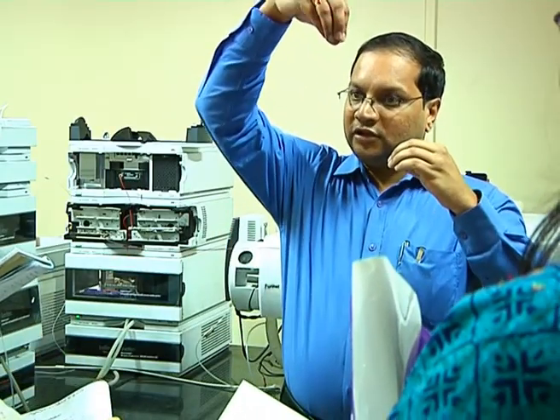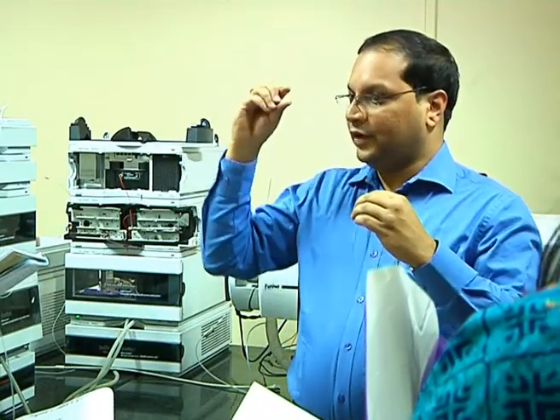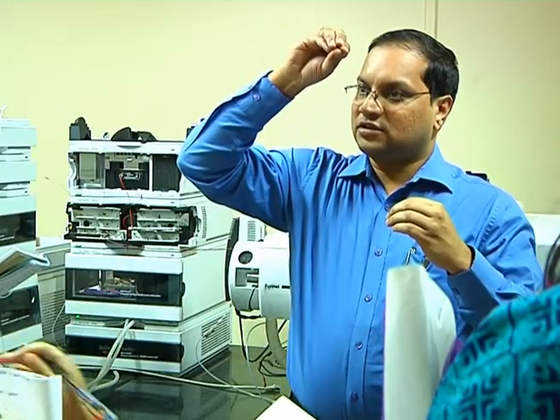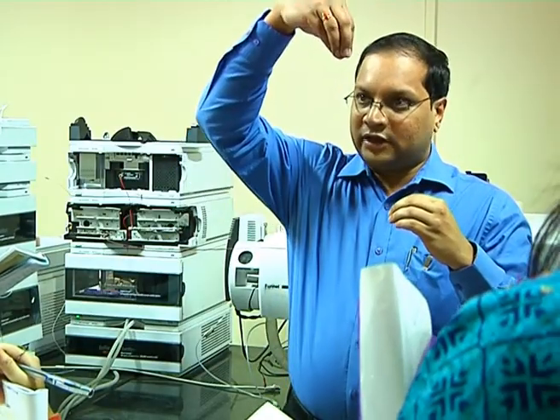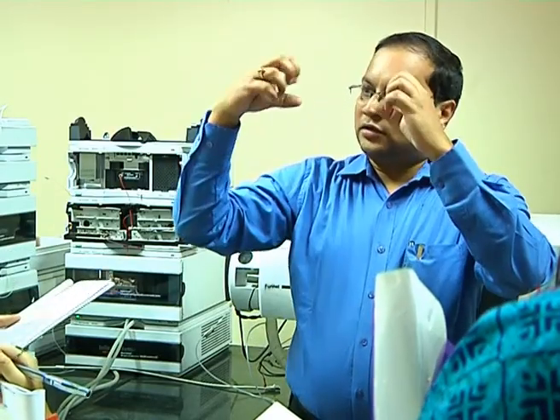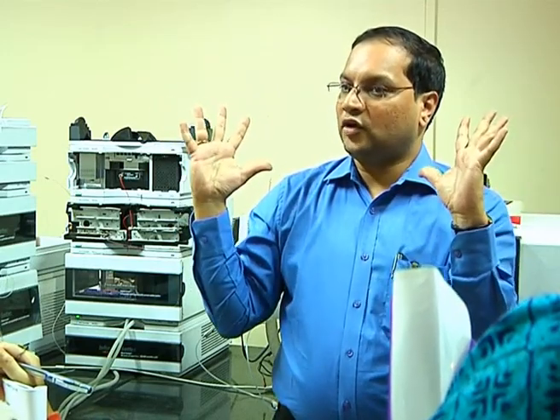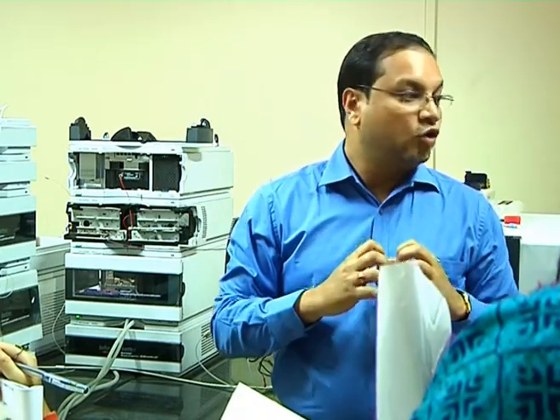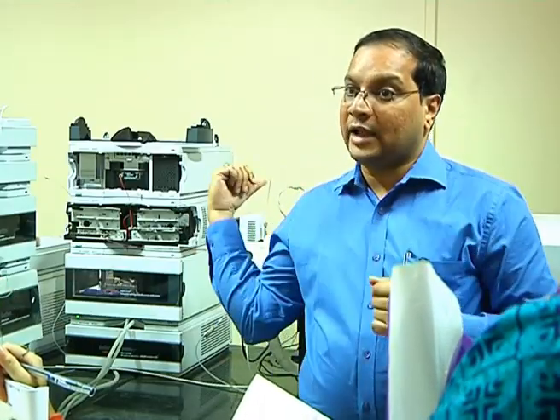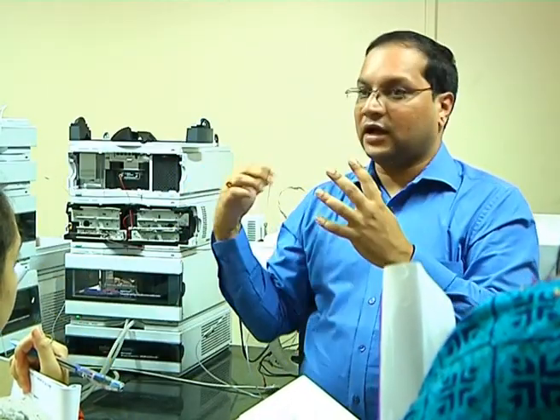When the spray is happening, imagine a droplet of liquid with different charged peptides inside that droplet. It has come out into that high temperature. Acetonitrile gets evaporated slowly. The positive charges come closer. The moment they get closer, they will repel, and they will explode. We call it Coulombic explosion. That is the phenomenon in electrospray ionization. You get a Coulombic explosion, and many such explosions are happening in fractions of seconds. All get evaporated because of the high temperature.